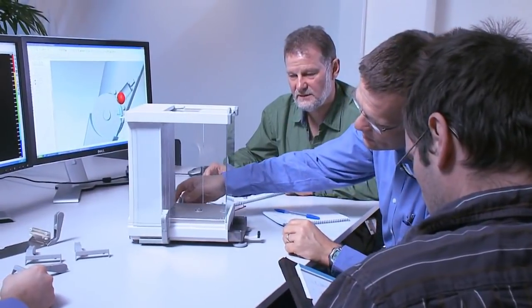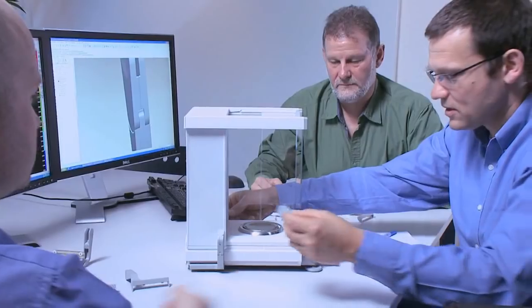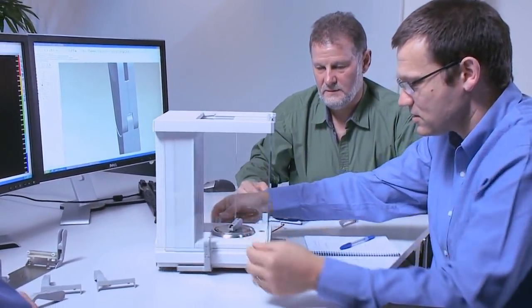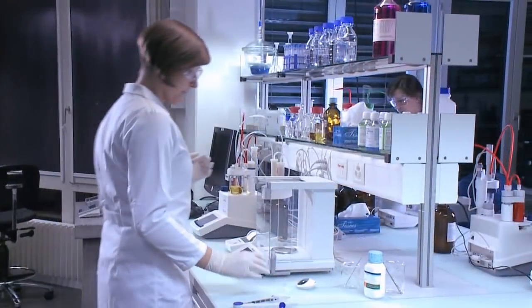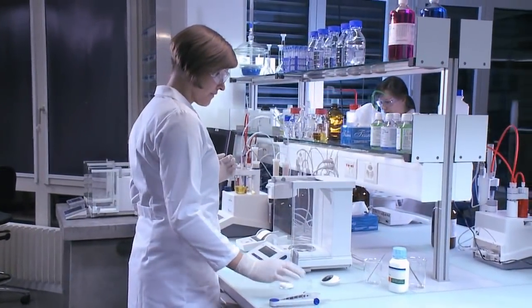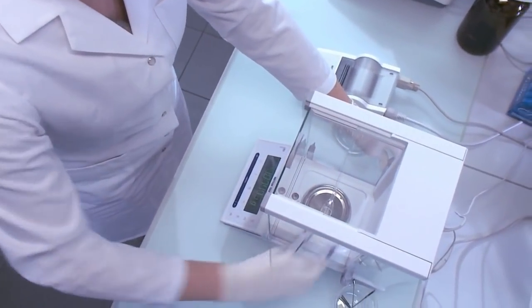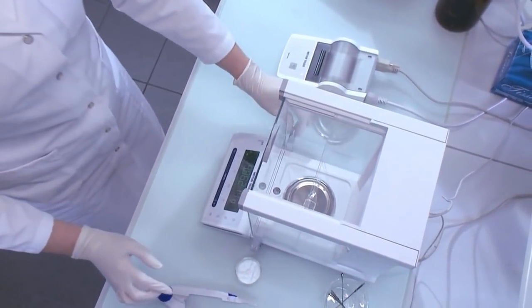everything. A balance should also be efficient in operation. The clever Ergo Door saves time - you can operate both draft shield doors at once, so while one hand opens the door, the other places the weighing sample on the weighing pan.